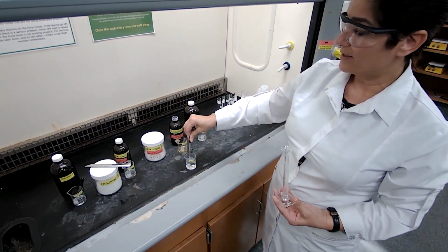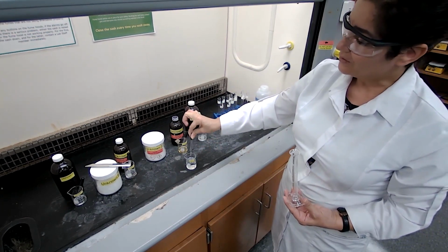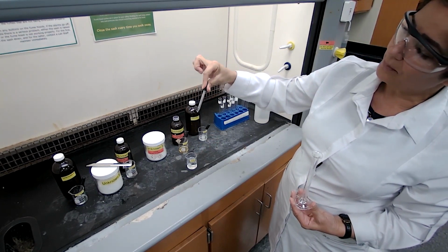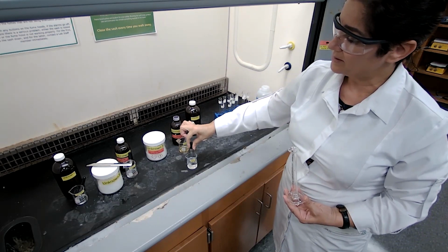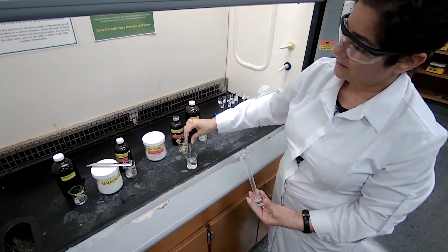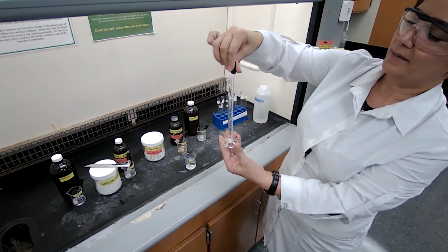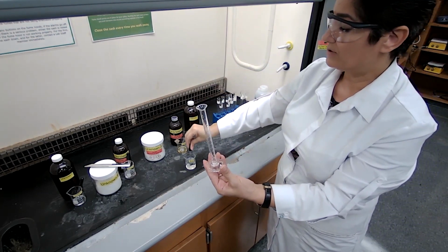A full dropper is about 1 milliliter, and that approximation is valid. To get a full dropper of the liquid, I squeeze the dropper rubber ball and release it while it's in the liquid, and the maximum amount of water gets in, and I transfer it to the graduated cylinder.